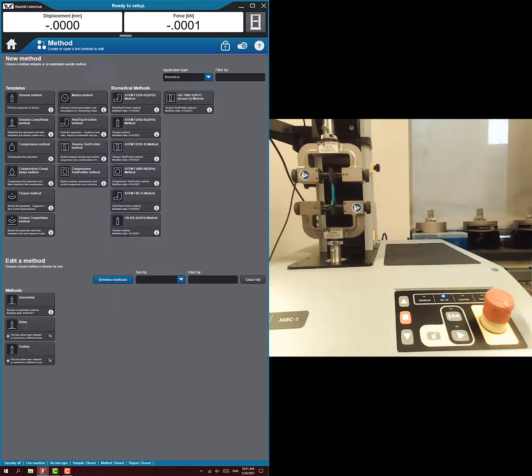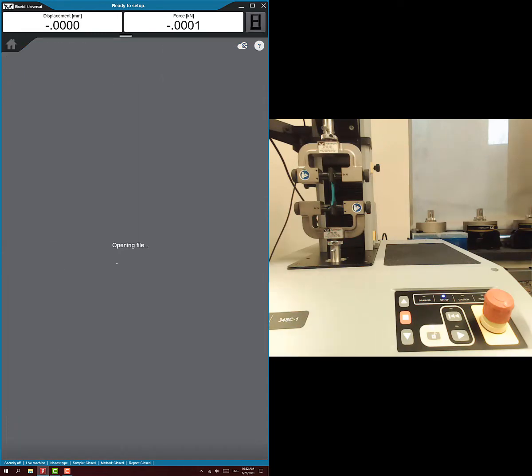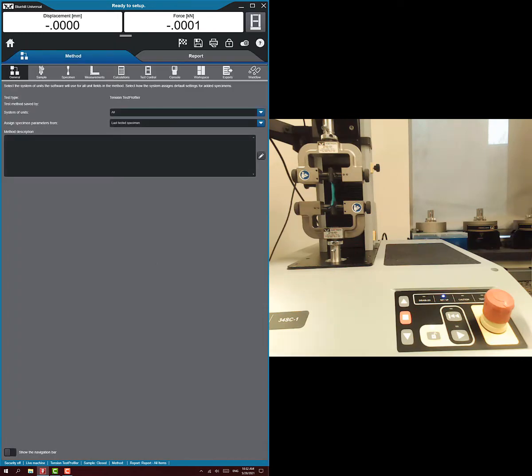I'll start setting up the method. None of the standard methods work well for hysteresis. We're going to use the tension test profiler method — that's what you're looking for: tension test profiler.